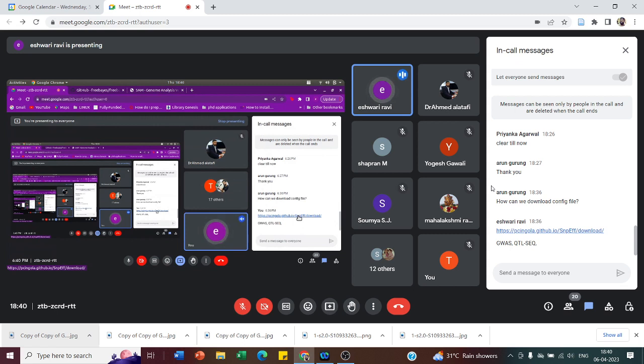You have to have two samples, one normal sample and one test sample. Basically that is four FASTQ files. So if you can, please do that. Of course, they will take a huge data space. I will share all the logs, and you can follow them if you want the desired result. And always email me your query if you want, after today's session. Any doubts?